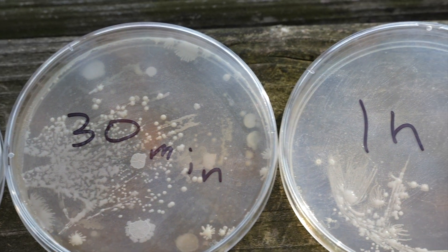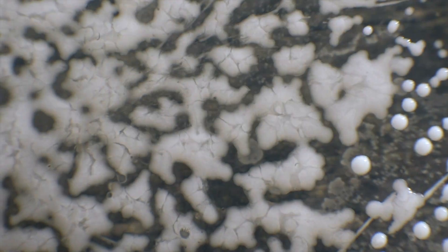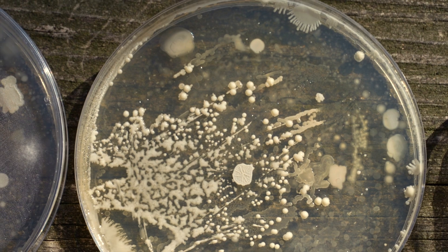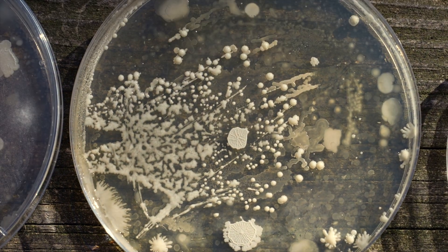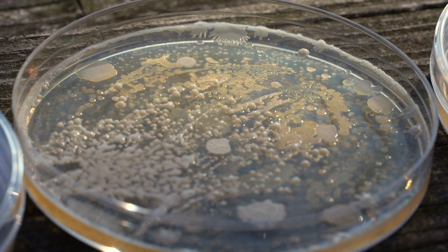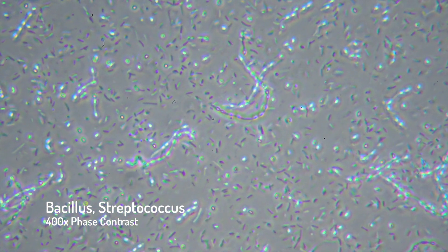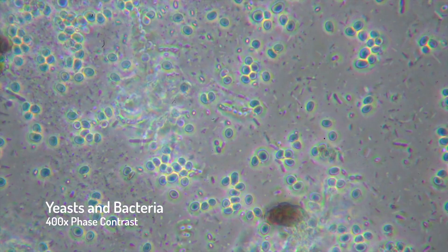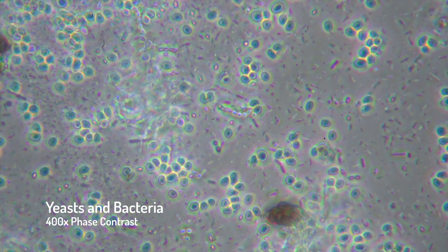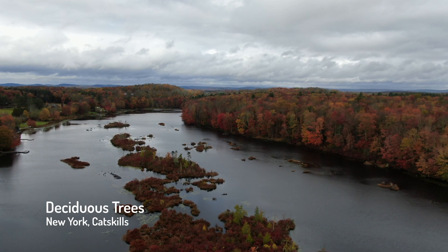After my run, at the 30-minute mark, things started to get pretty interesting. My post-run swab resulted in some dense clusters and spreading colonies of microbes, likely a species of Proteus or Bacillus bacteria. These bacteria are motile and able to spread across the petri dish in web-like structures. Meanwhile, these small circular colonies are likely Staphylococcus or Micrococcus. Interestingly, the majority of fungi from the previous petri dish have pretty much disappeared. The combination of salts, water, urea, and lactate from sweat combined with a higher body temperature are a much better breeding ground for specific bacteria, yeasts, and fungi. Just like how different trees are adapted to certain environments, different microbes prefer different levels of salt, acidity, humidity, and various other factors.